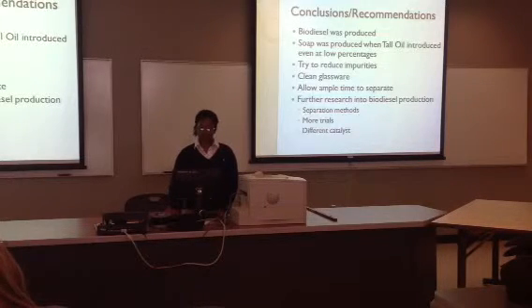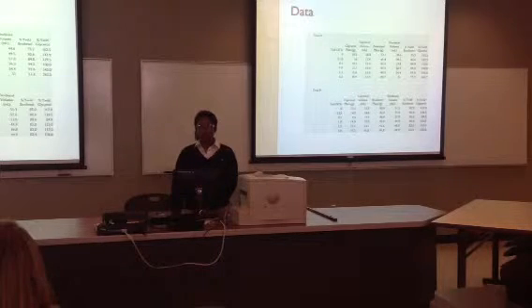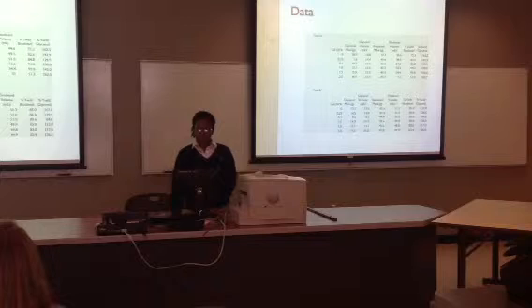Can you go back to your data? How did you calculate the percent yield of biodiesel? We did the theoretical yield and information, but actually the theoretical was like 100. So your batch sizes were different sizes? No, they weren't.